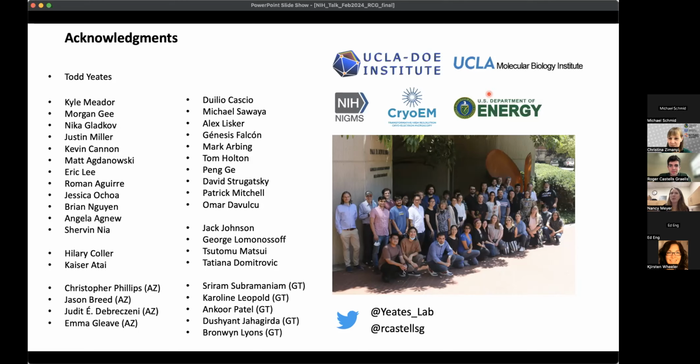I think the questioner might be interested in knowing which software package you were using for some of these. For the design or the data? Oh, I'm sorry, for the focused refinement. In this case, we recently have been using more CryoSpark.